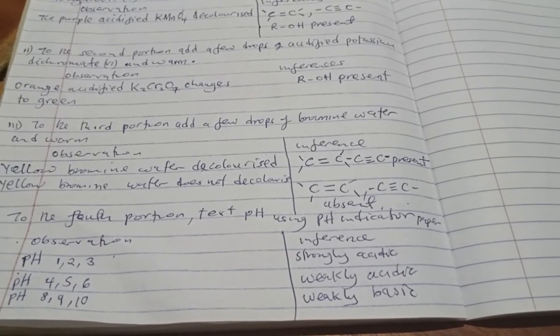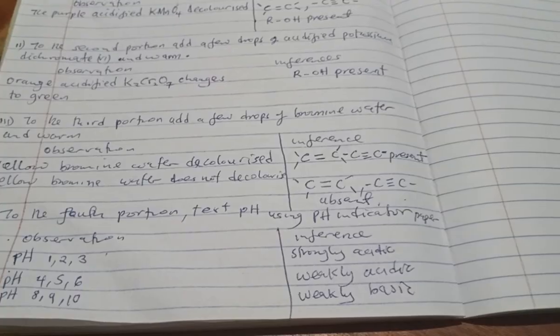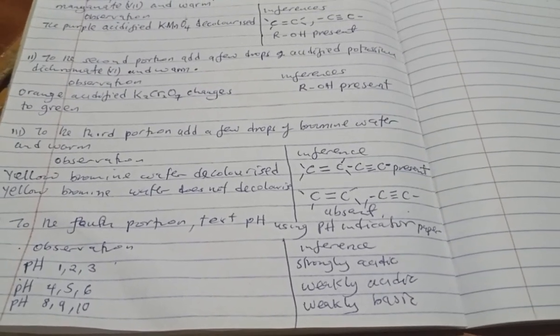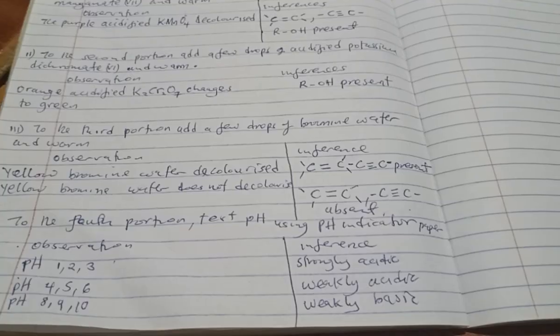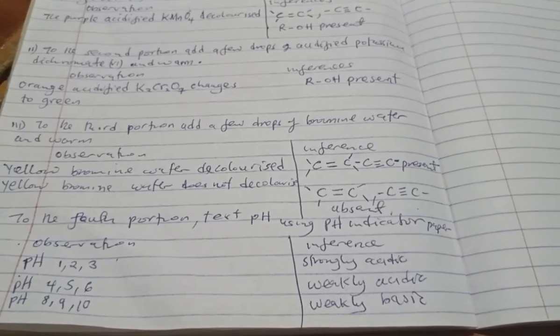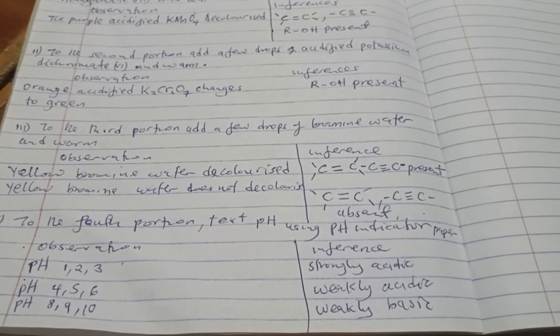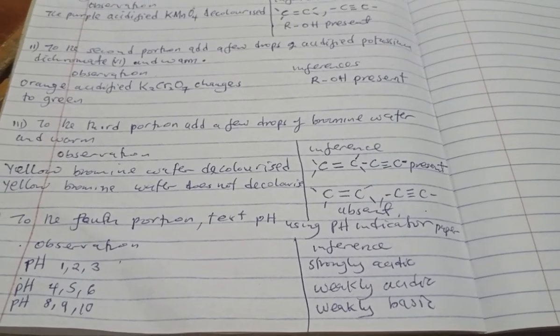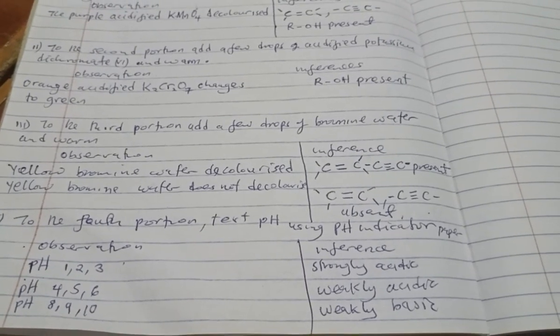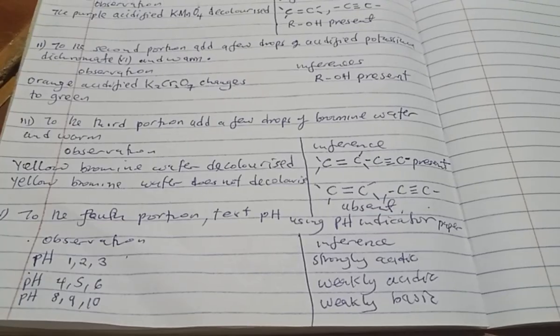Then if it doesn't decolorize, then you will say that they are absent. So remember that bromine is not a strong oxidizing agent, so it is not used to test for ROH. So in this case, you avoid ROH because bromine is not a strong oxidizing agent. Good. Maybe you are told to do what?